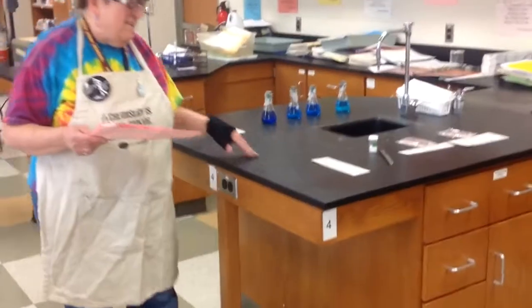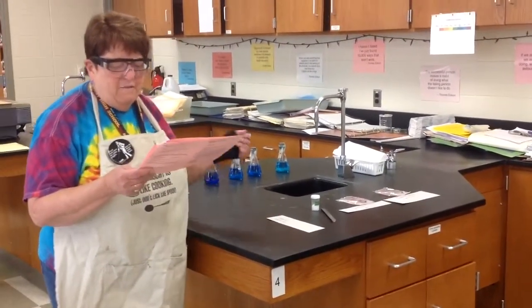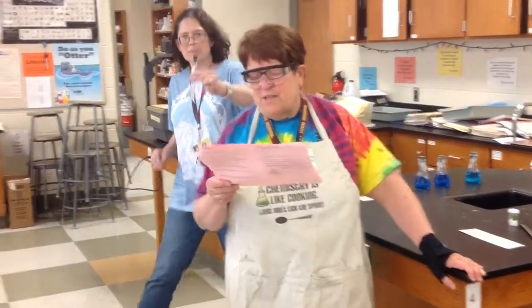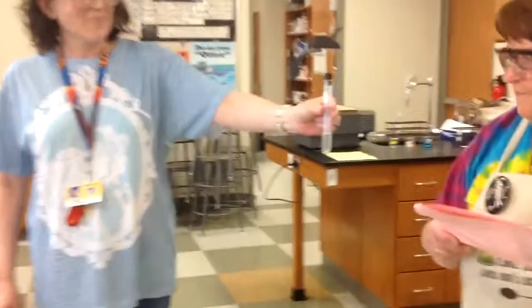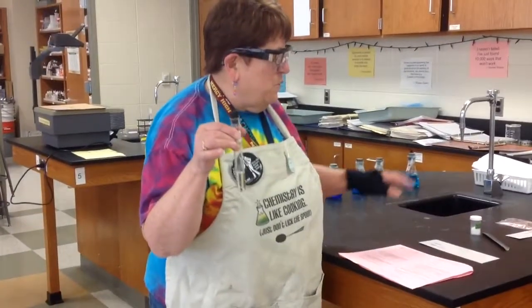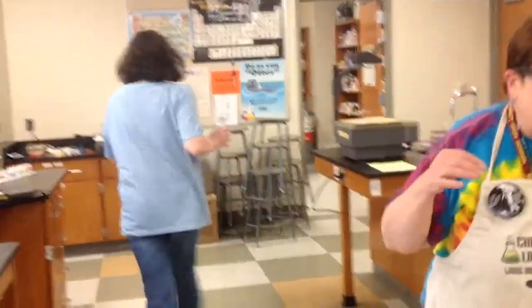And then in steps 4 and 5, you will be getting from your teacher a test tube which has some supersaturated solution of sodium acetate. Thank you, my lovely assistant. And you'll add 1 crystal of sodium acetate to this and see what happens, and compare this with what we have on the table. Your teacher will probably do this in your class to start with.